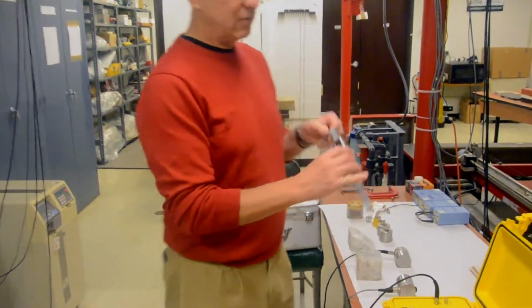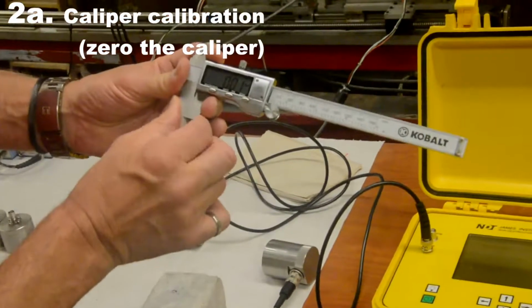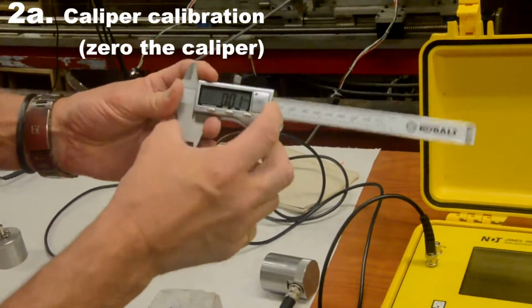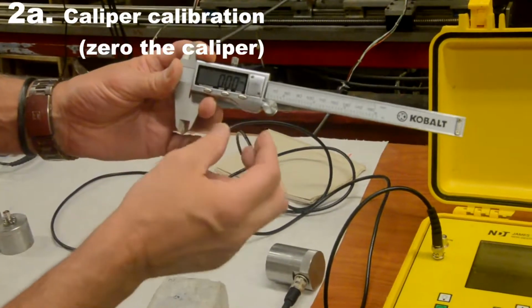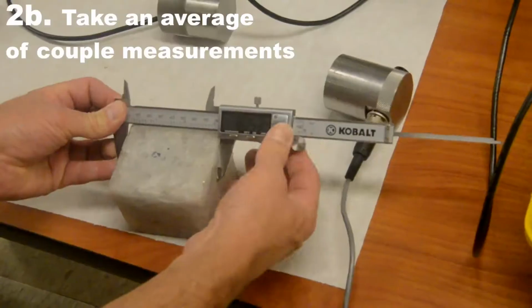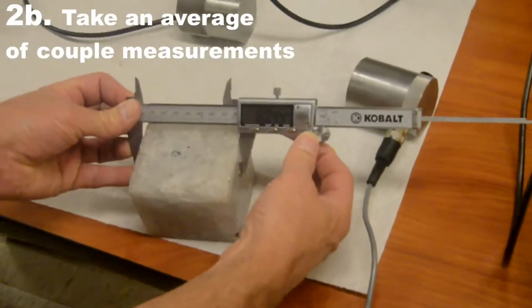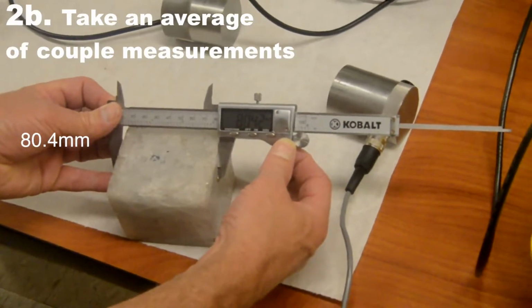To do that, we're going to use just a simple caliper. Now with the caliper, we want to know that it's at 0, so we press this closed, and then I just take 0, and we're good to go. So let's make a measurement. And our first measurement, trying to keep this parallel, is 80.4 millimeters.